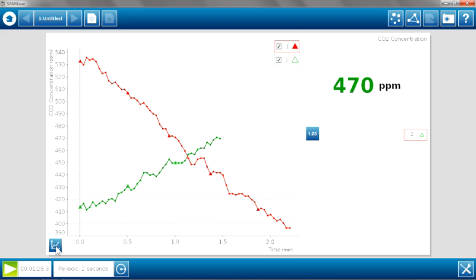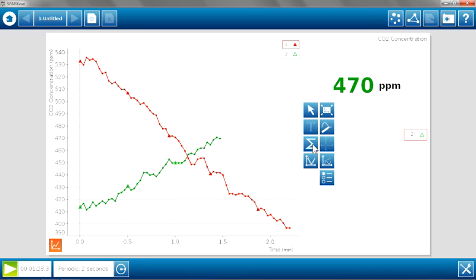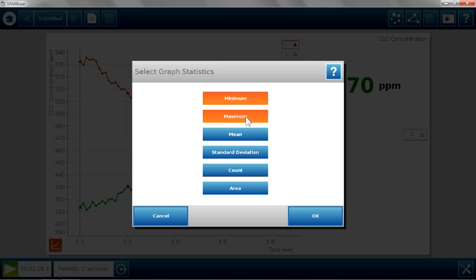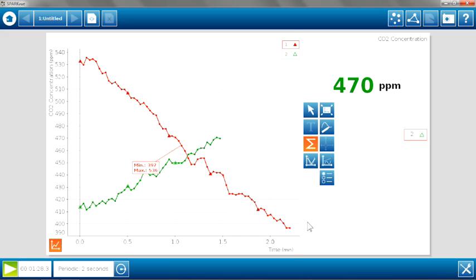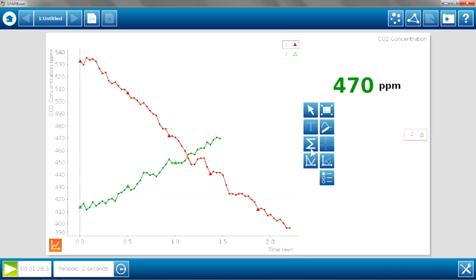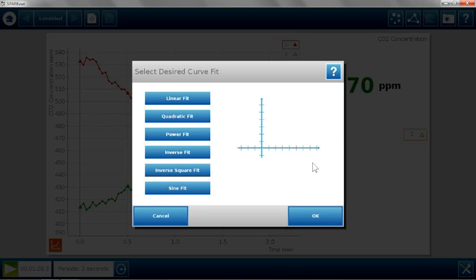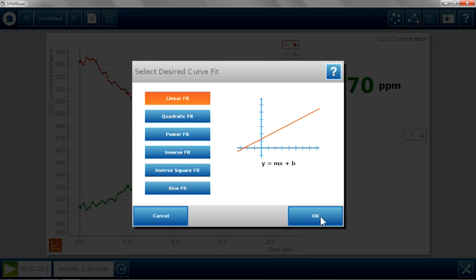I'm going to open up my graph tools by selecting the graph icon and there are a few things that you can do here. You can use a statistics tool to get the minimum and the maximum. So if you want students to look at what the carbon dioxide was at the very beginning of data collection and at the very end of data collection and find the change in concentration that occurred during that time period, the minimum and the maximum is a good tool to use. You can also use the graph tools to find the rate of the change. Using this tool, we can do a linear fit. And you'll see the linear fit gives us the rate of carbon dioxide decrease. In this case, negative 66.8 parts per million per minute.